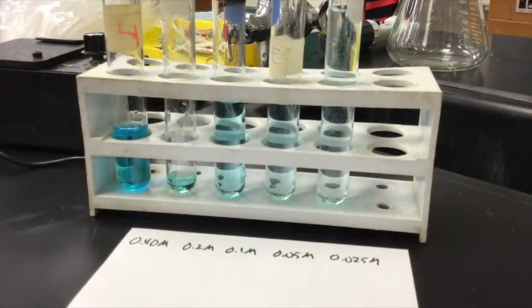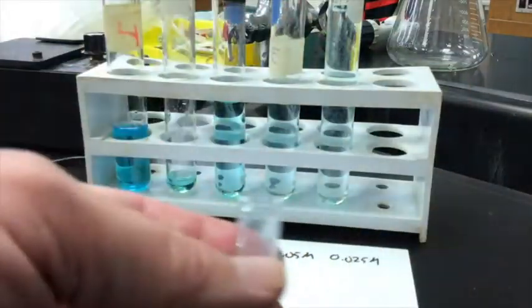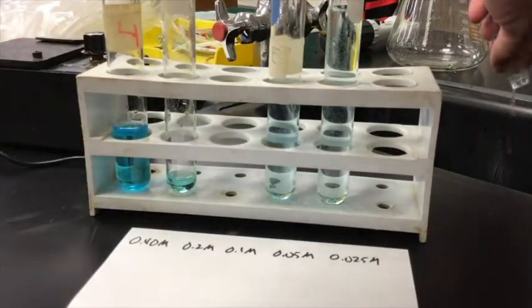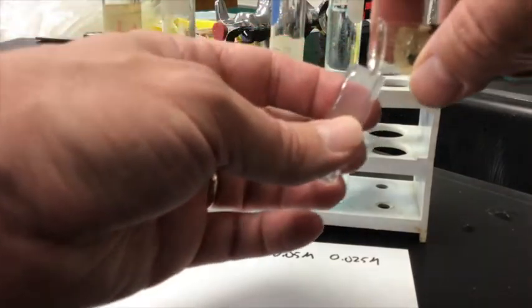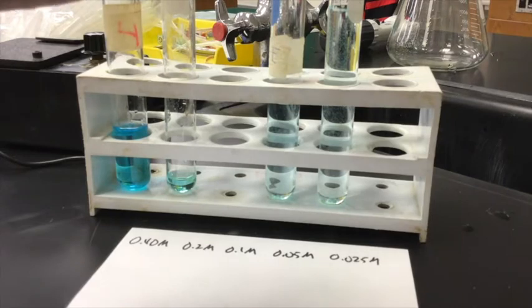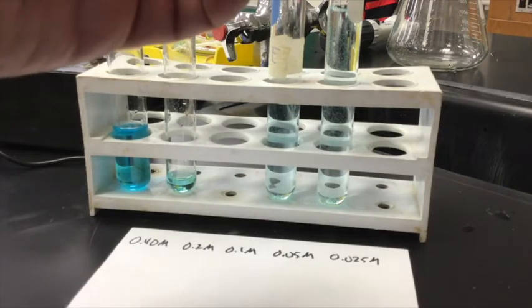So take this out of here. Dump it. Take my 0.1. Fill it, dump it, fill it, dump it, fill it.